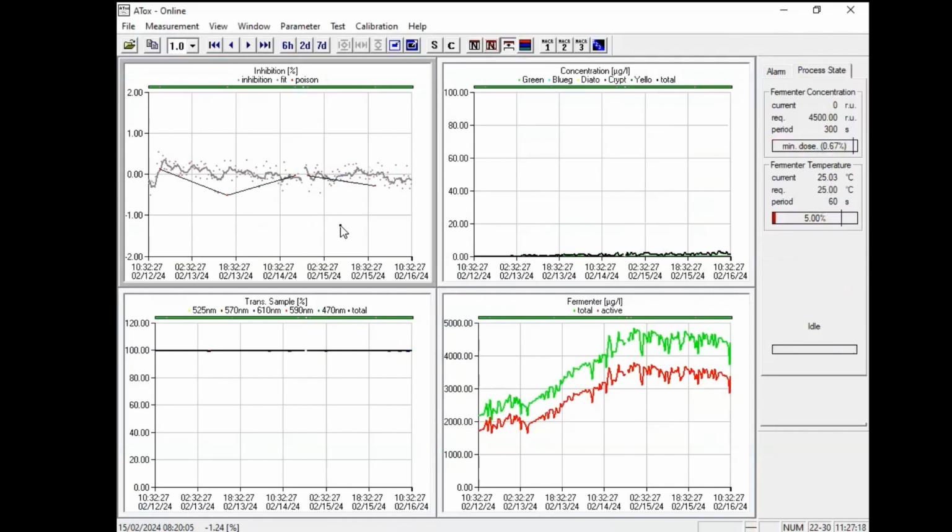So everywhere in this system you have a build-up of biofilms, depending on the algae from the culture, but mainly from the sample water outside. You have bacteria, you have algae, you may have also mineral components, so you have to clean. It is rinsed, but still by the rinsing, you do not get rid of everything. The biofilms will be growing over time. So you have to do regular maintenance. We say every week you have especially to clean the loops.